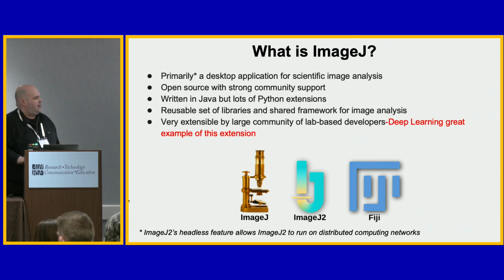And it's very extensible. One of the unusual things about ImageJ that's made it successful is that there are professional groups like mine that have core developers that maintain things, but the vast majority of these wonderful plugins were developed by one of you, a bench scientist who had very little programming experience and developed a wonderful tool. And so that really makes it great that a number of really great developers develop something for their own use. And deep learning is a great example.